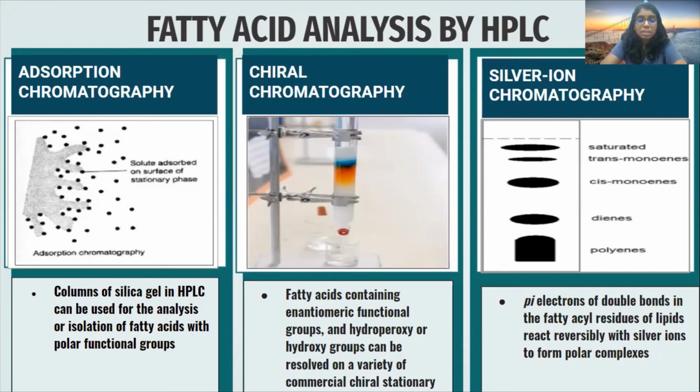Lipid samples are usually applied to a plate, and this is developed with a suitable mobile phase. The fully saturated lipids do not form complexes and will migrate to the top of the plate. Those containing one monoenoic fatty acid residue will come next, and the components of increasing unsaturation then follow.